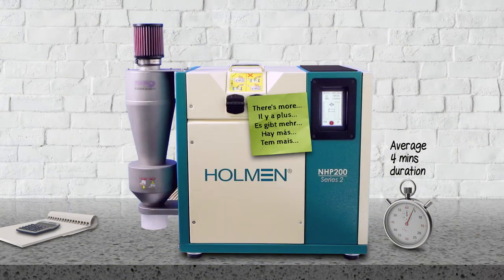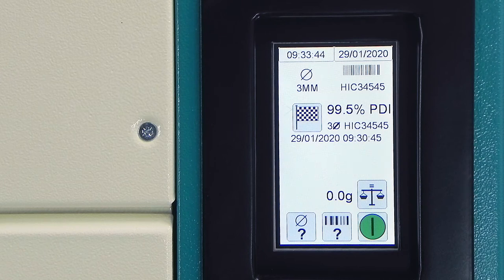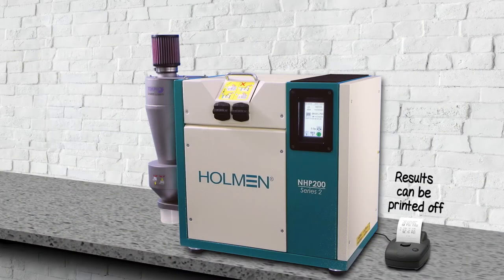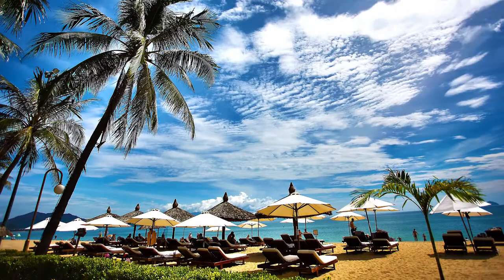But it does more. When it's finished, it stores the results and displays them on its touch screen. They can be printed off, or sent to other software for additional analysis. It can even email the results to the factory manager, wherever they are.